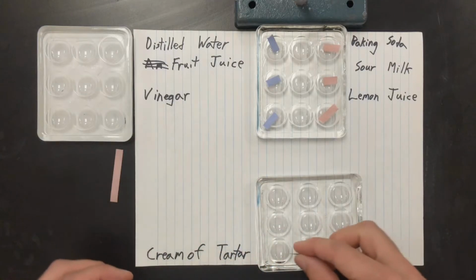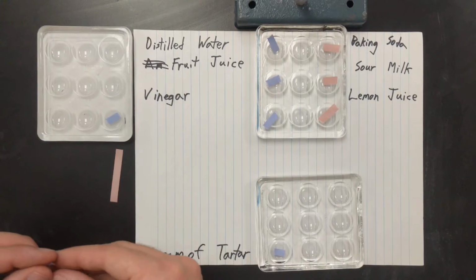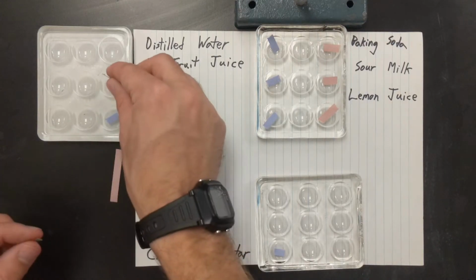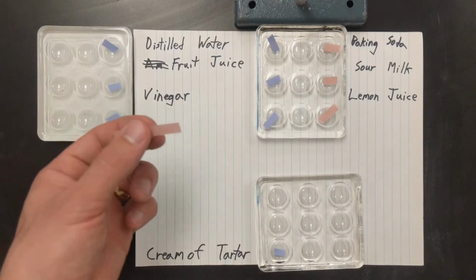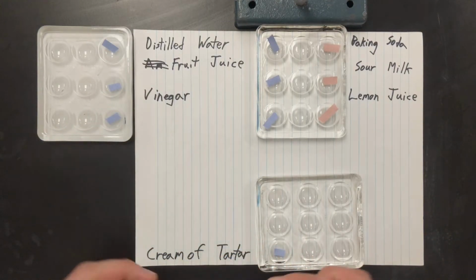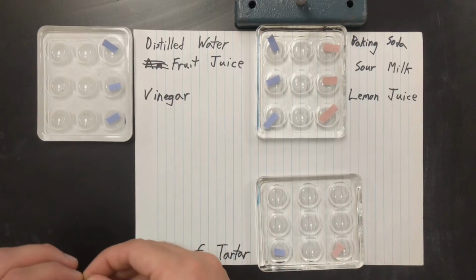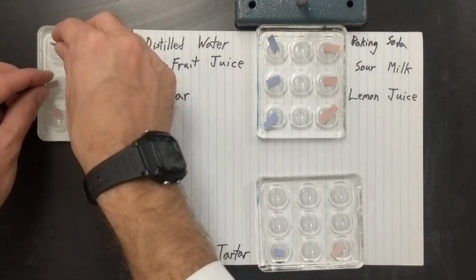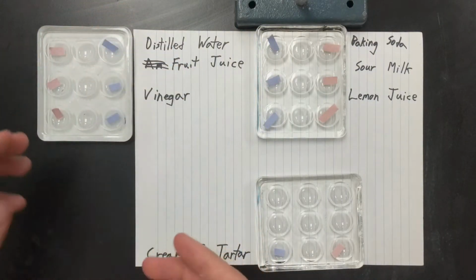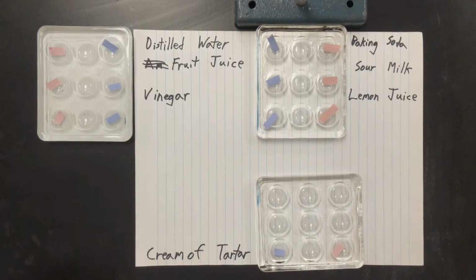We're going to need quarters because we need one for cream of tartar as well. So that's vinegar in this corner, fruit juice, and distilled water. Next, we need to rip up our red litmus paper. So we have 1, 2, 3, 4. Hopefully my fingers, I think I added a little bit of sweat to that one, but hopefully that's still clear.